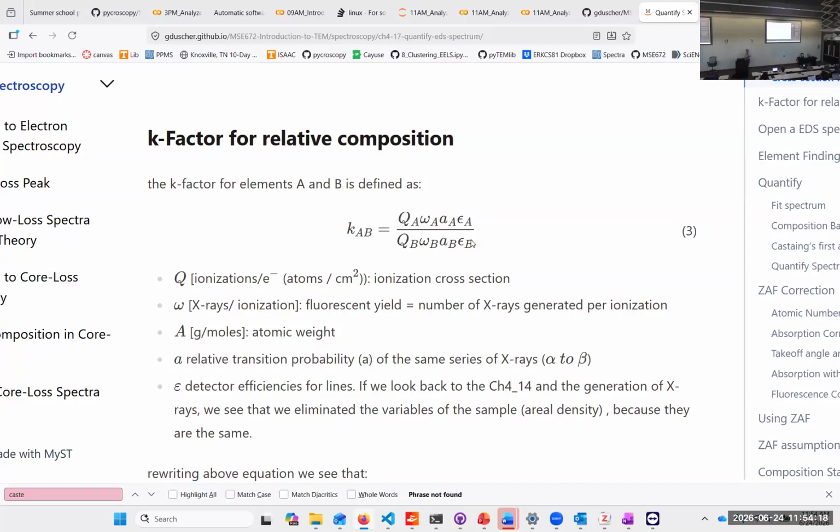Other materials as well, so you can use very clean aluminum. If you have a good furnace, you mix a few of them together, and you can do that too. So some compounds, if they're ordered, you know exactly what their composition is. So these kind of samples is what you're after, and then you can calibrate your system with that. And it depends on what kind of sample you have. You can get extremely good at that.